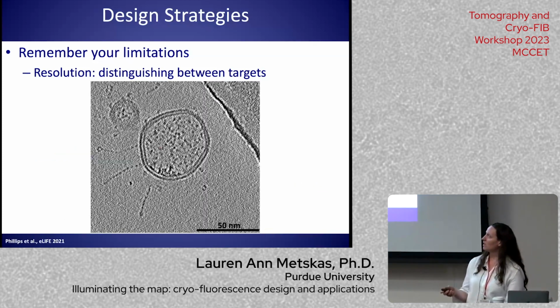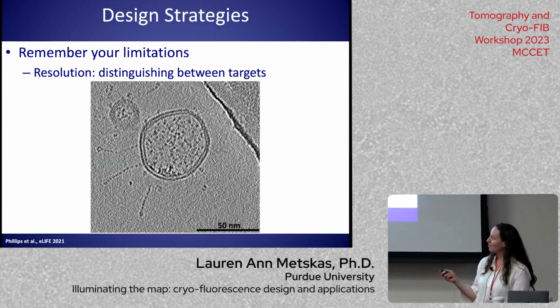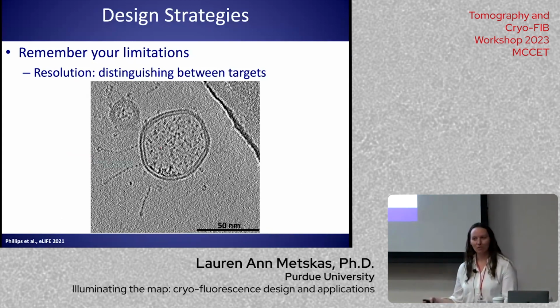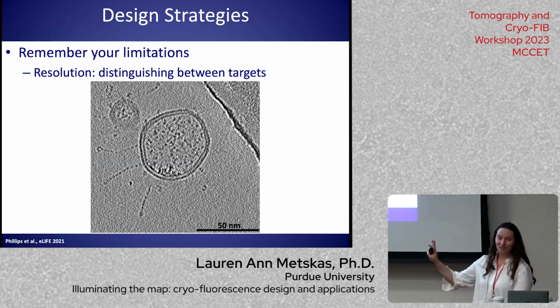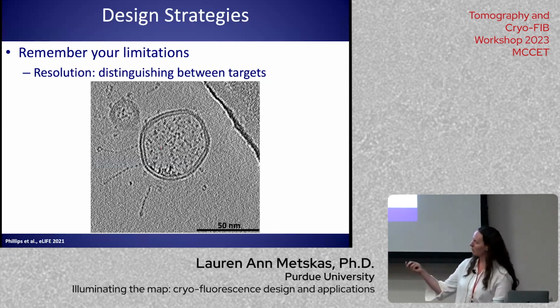And so what this means is I've got a little outer membrane vesicle from Shewanella oneidensis, and I discovered that there were these little antennae. I have no idea what they are. Nobody else does either. We'd love to know. And I did actually do a mass spec on it, but we got like 800 hits. So say we had an idea of which of those 800 proteins was this guy right here, that beautiful hollow little ball on the end.